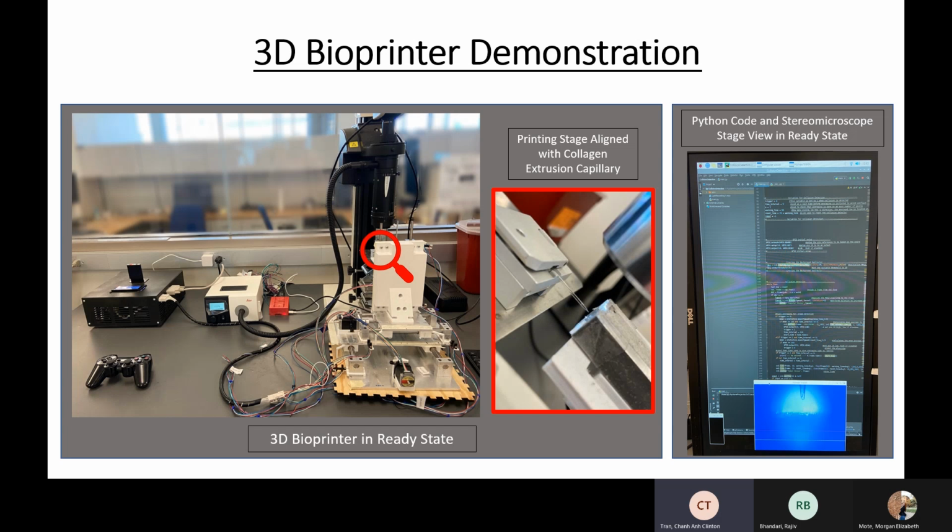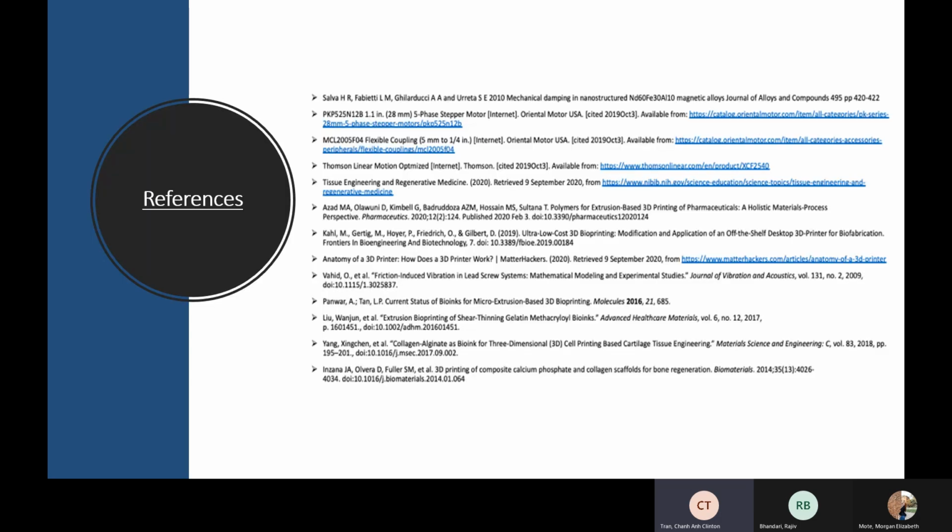We must make note that the current design shown in this photo is the Mach 1 mechanical stage design. Our third generation design is still being fabricated. However, the developments in the operation and the sequencing of this device have been made through this semester, and we successfully worked with the electrical engineering team in order to become educated users of this technology. Here are the most noteworthy references that we utilized for the transformation of our project.